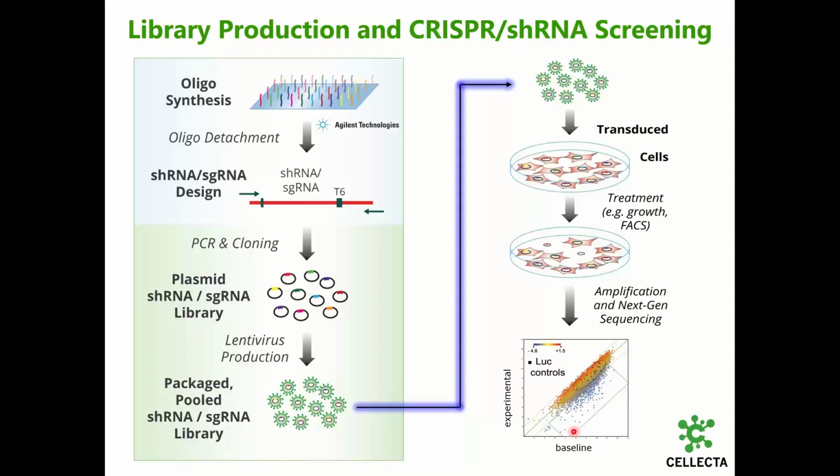This sort of screen is useful to detect genetic vulnerabilities in cancer populations. It's also often used to identify genes that confer resistance to various therapies or treatments, to identify genes that enable cells to be resistant to a particular drug or compound.